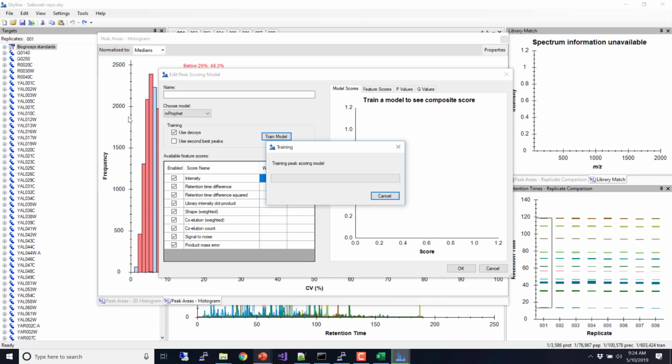So if we can get more precise data, then hopefully that will improve our statistics. And if our goal is to get precise data on a certain set of proteins, then we know that if we were willing to just narrow down to a few proteins, we could do all kinds of experiments on the digestion to get really, really precise assays. Clinical researchers optimize every step of the way, and then write a full protocol, and even have to get FDA approval and everything. But we're just going to go one little step in that direction.